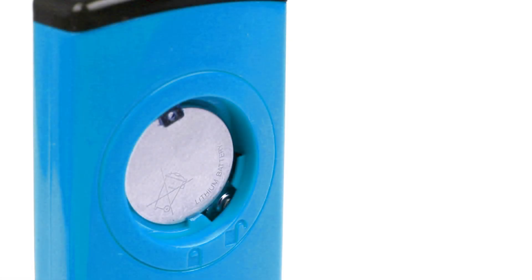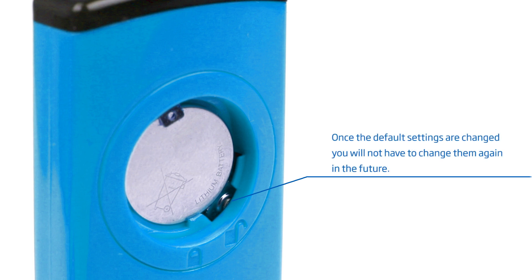There is a third button in the battery compartment that allows the user to choose the displayed temperature unit and adjust the automatic shutoff time.